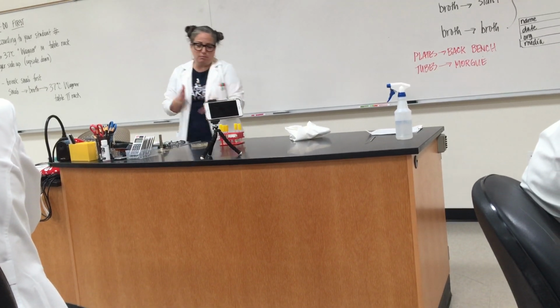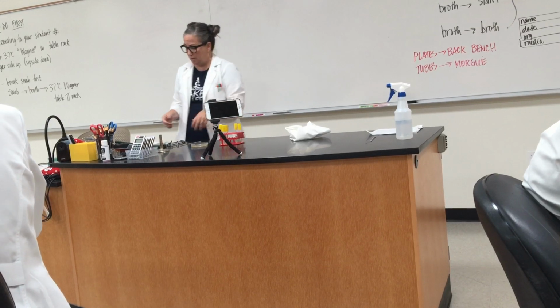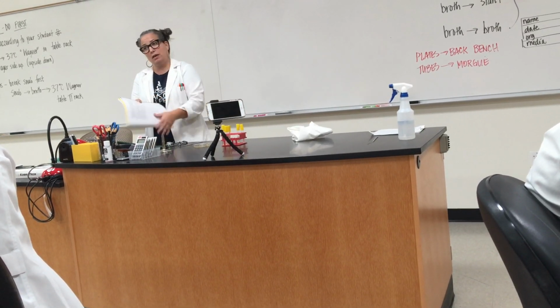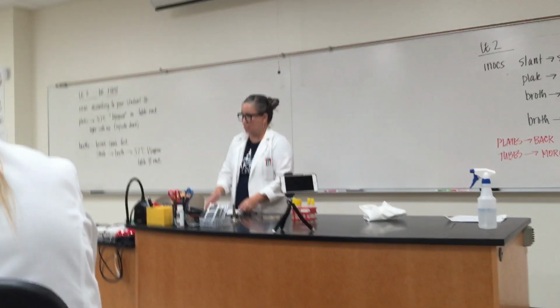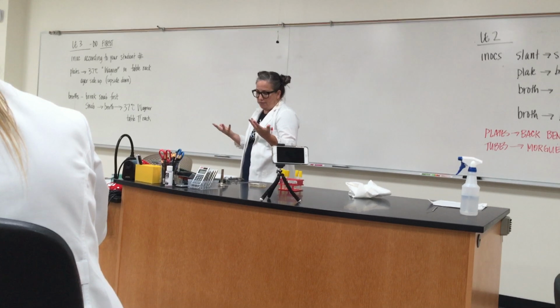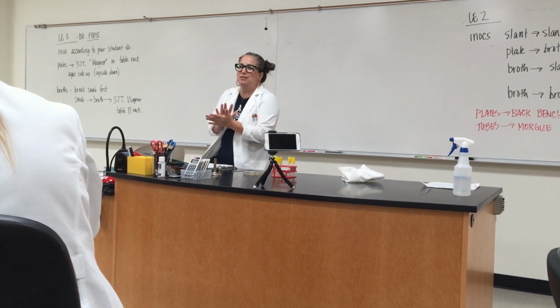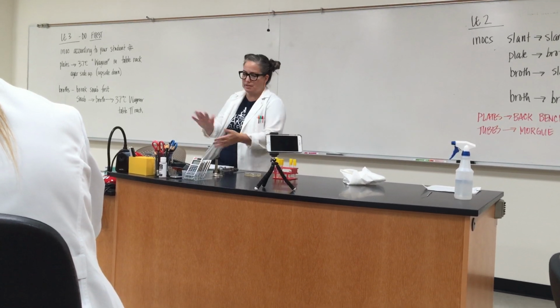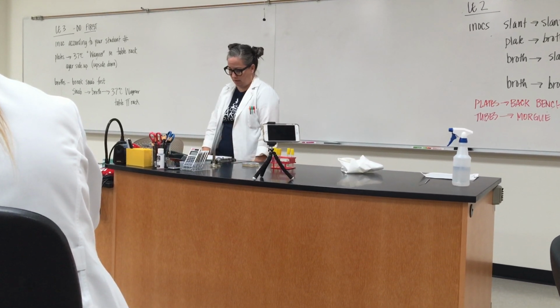Blow dust on it. So you can blow dust or you can find a little dusty spot. Right? Moist lips pressed against the agar. We'll see how clean your lips are. And you just give it a little kiss. Right? Coins or cell phone, right? So you can just take some inanimate object if you don't have a coin or you don't want to touch your phone. You can just take something and touch the agar with it.